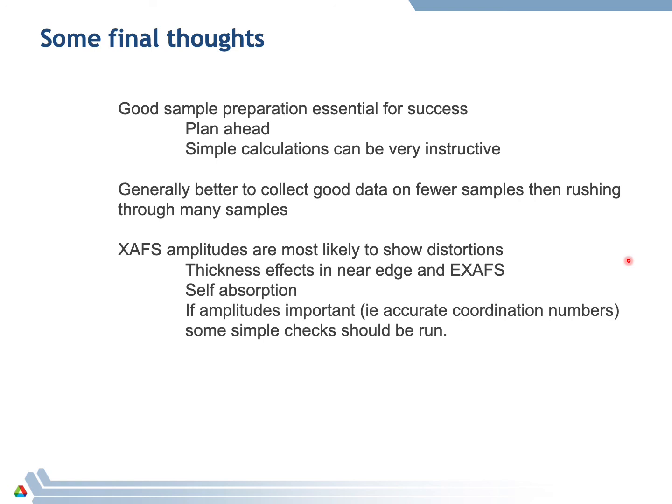It can also help you to determine how difficult the measurement will be. For example, you could calculate for a very dilute sample what fraction of the beam will be absorbed by the element of interest, and you might find that the measurement time will end up being very long.